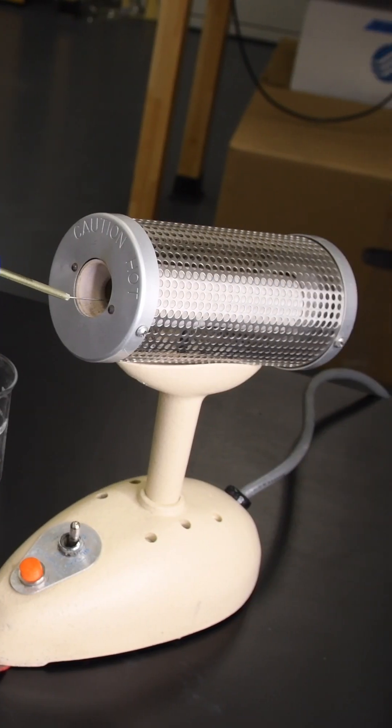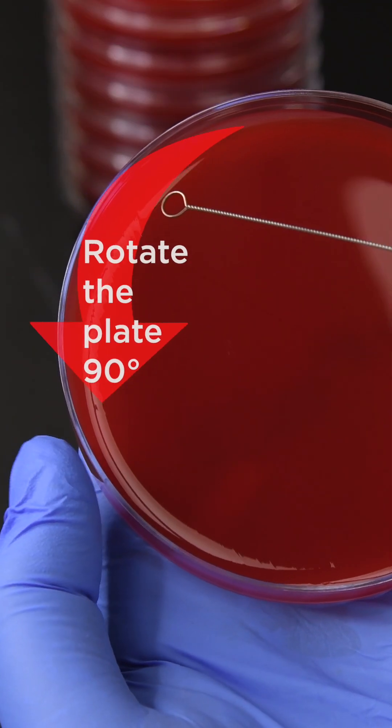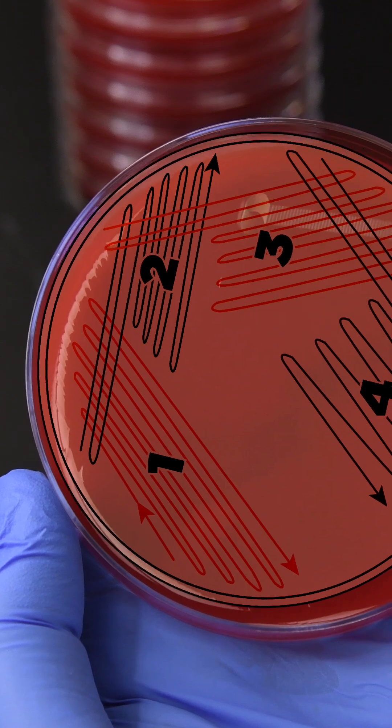Re-sterilize the loop and remember to let the loop cool before continuing to the next quadrant. Rotate the plate 90 degrees and then proceed to streak the remainder throughout quadrant two.